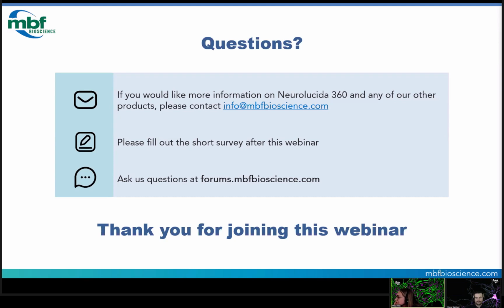How do I know what settings to use for the Golgi filter? So it looked like, Shane, when you were giving the demonstration, you set a sensitivity setting and an edge clearance setting for that filter. And we've designed the batch pipeline to allow you to not only conduct a multi-file processing workflow, but you can also leverage the tool to find the best parameters for your data.